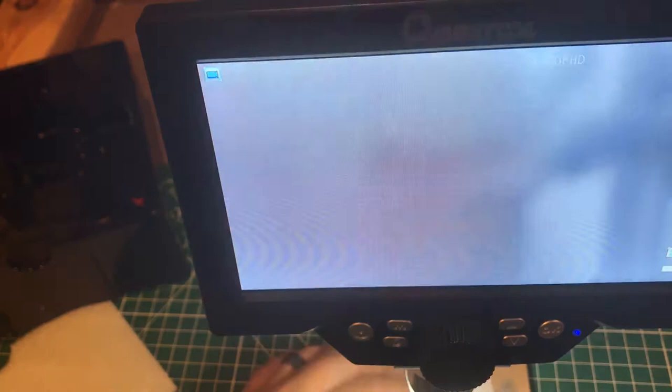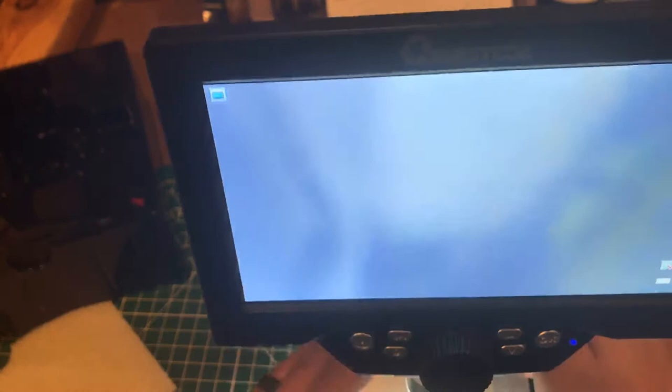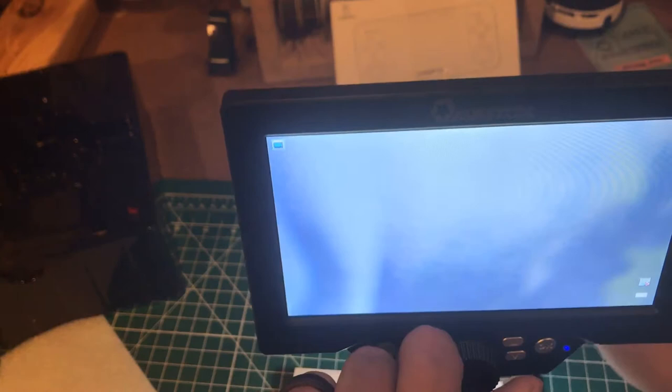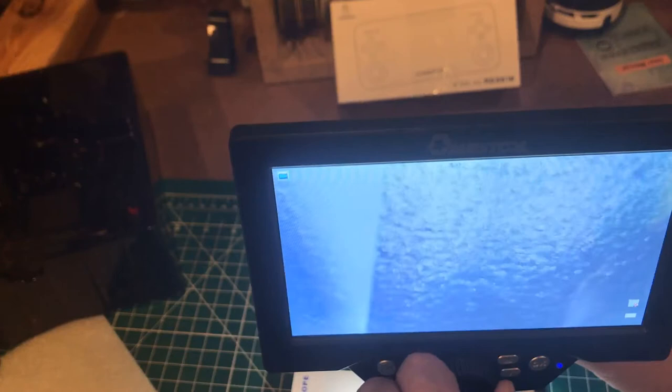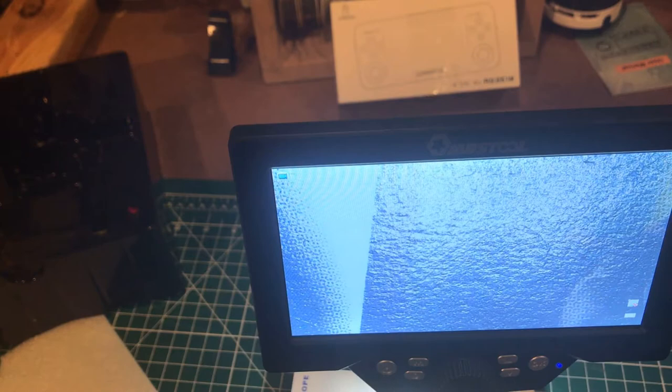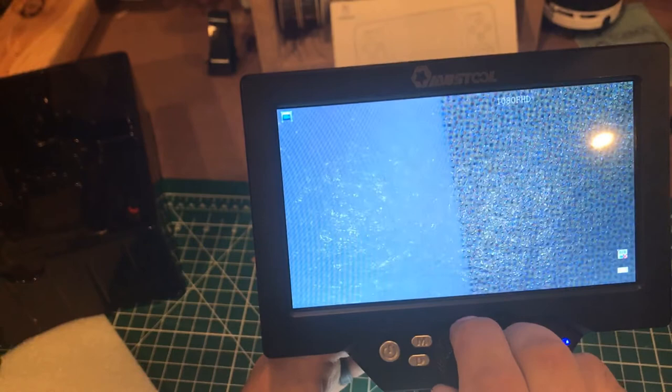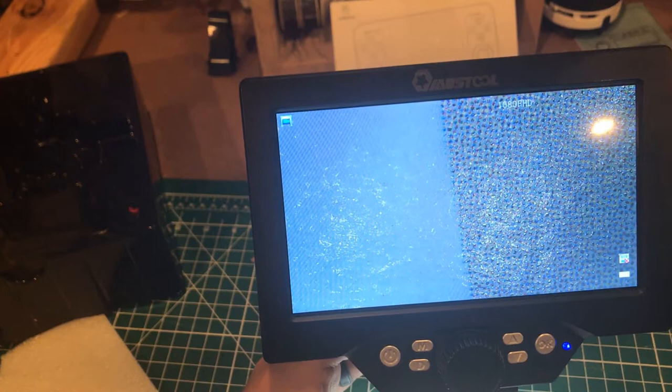The screen looks a lot better from where I'm at. I'm going to try to get something in focus. Wow. Yeah, I don't think this camera is doing that justice, but that screen is very, very good. Like, holy cow. You're not seeing that as clear as I can. I don't know if you can tell, but that is unbelievably good — you're seeing the individual dots of ink on that paper. That is pretty crazy.